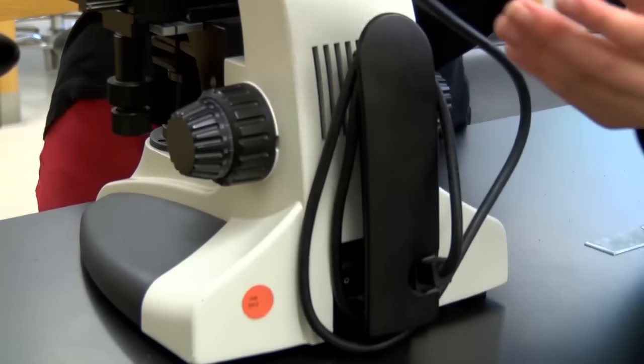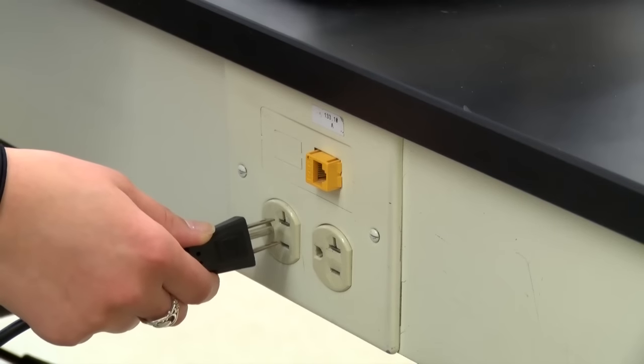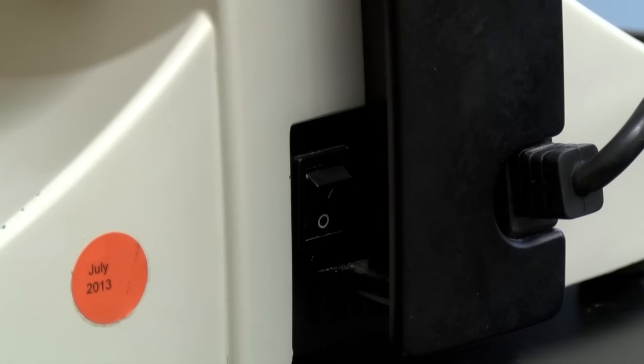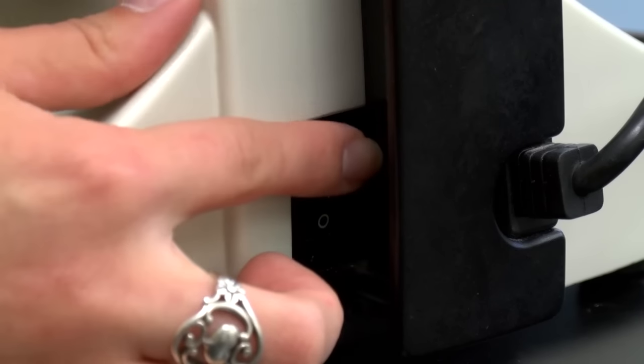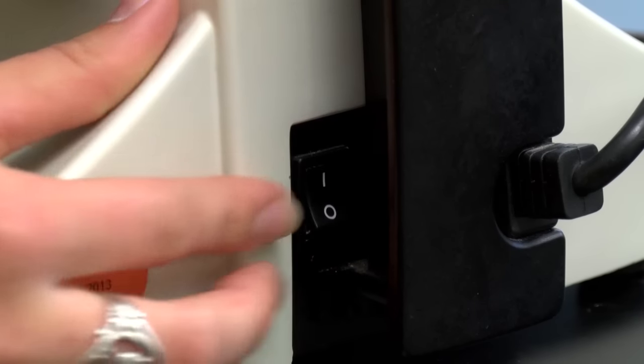Unwind the cord from the back of the microscope and plug it in. The on-off switch is on the back of the scope and may be hard to find if the power cord is still wrapped around the holders.